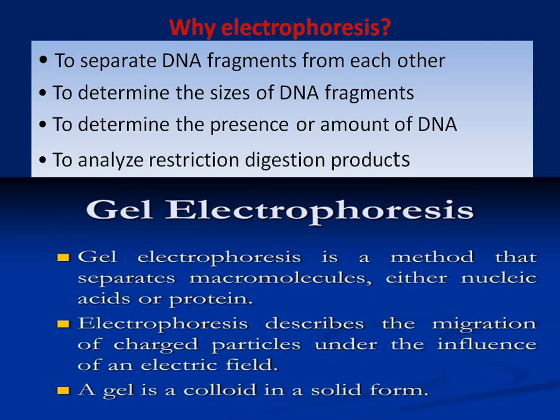It is also used to determine the sizes of DNA fragments with the help of different ladders which are used along with the DNA fragments. It is also used to determine the amount of DNA, that is, how much DNA is present in a specific quantity of DNA samples.